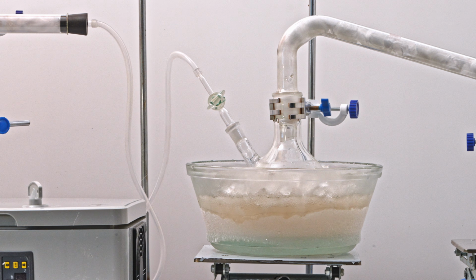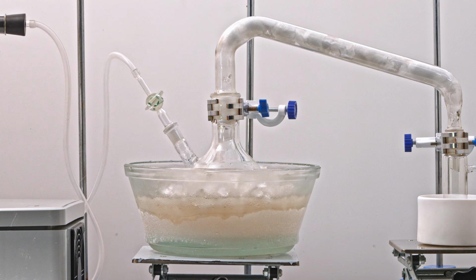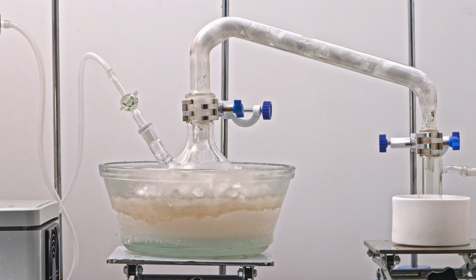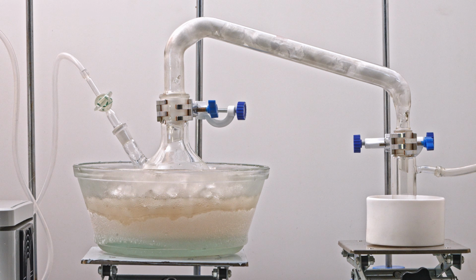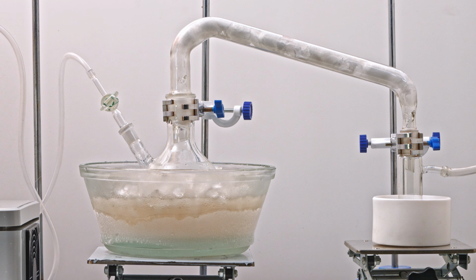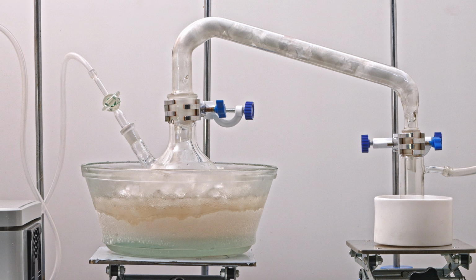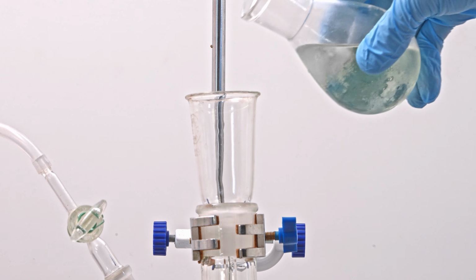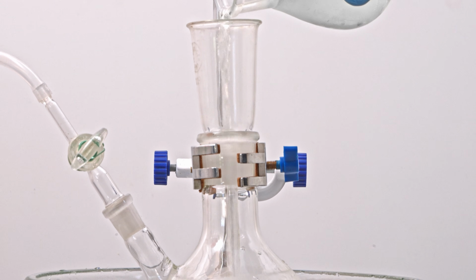From the ozone machine, the dry ozonated oxygen enters a flask containing a mixture of nitric acid and phosphorus pentoxide. Next, the same gas flow carries the vapors of dinitrogen pentoxide and nitric acid through a glass tube packed with phosphorus pentoxide. Dinitrogen pentoxide condenses in a small receiver flask cooled with dry ice. So, I'm pouring the freshly distilled clear nitric acid into our main reaction flask.